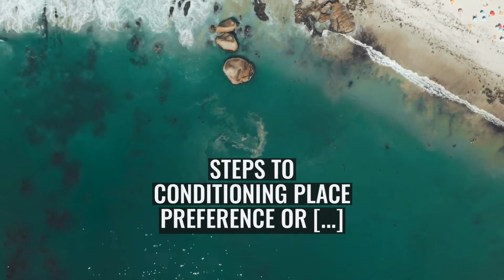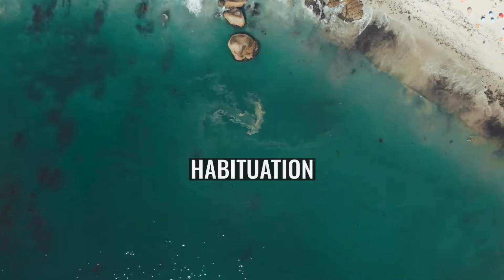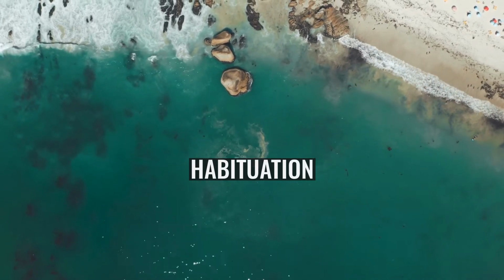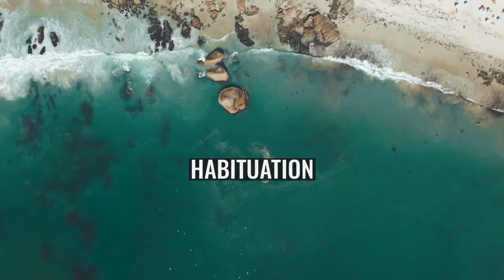Steps to conditioning place preference or aversion. Conditioned place preference involves three phases: habituation, conditioning, and preference testing. Habituation. In the habituation procedure, the animal is given a chance to explore the apparatus. This is done to reduce the effects of novelty and usually consists of one 5-minute trial.